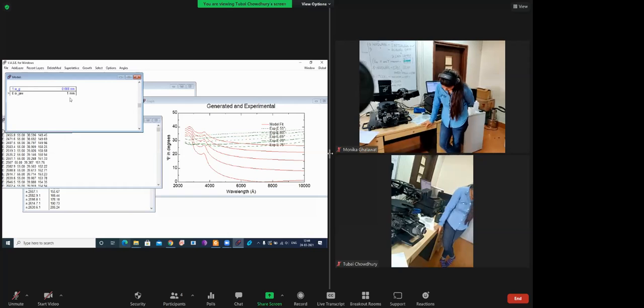But my point is, if instead of tungsten I use the Cauchy model, then what's the point of making any model for any metal? For gold, it is a well-known model. For tungsten, it is a well-known model. For silver, it's a well-known model. So I think there will be no point of studying the metals and making models for them if I can go for the Cauchy model. Ma'am, at least use it once. Okay, ma'am. Fine. Try it by using the Cauchy model.